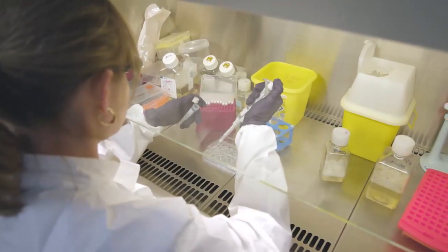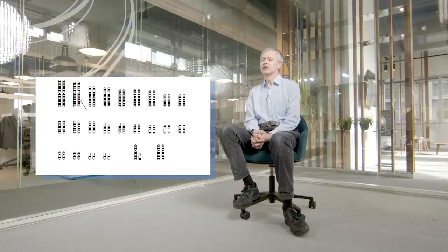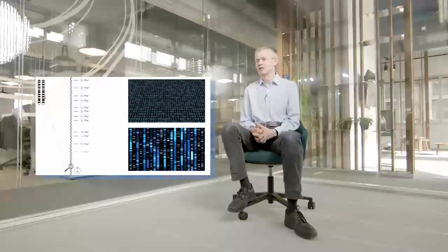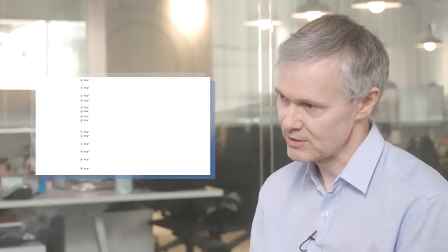When we have a sequence of interest on which we want to design TALENs, we scan this sequence with a machine learning model that has been trained over the years with all the data we have accumulated, and it will determine the sequences that have the highest probability of having a good activity. This machine learning model uses both sequence features as well as epigenomic features to determine the highest probability sites. This process takes place in a matter of a few dozen seconds.